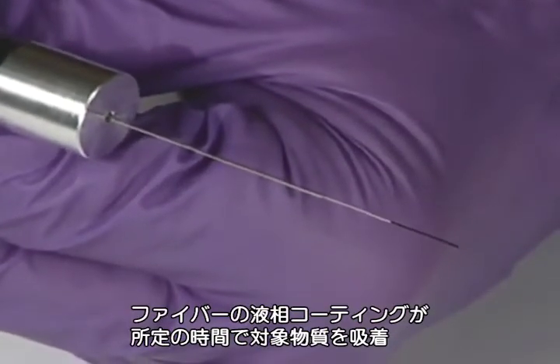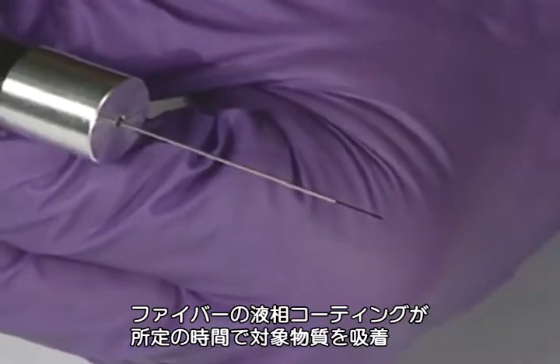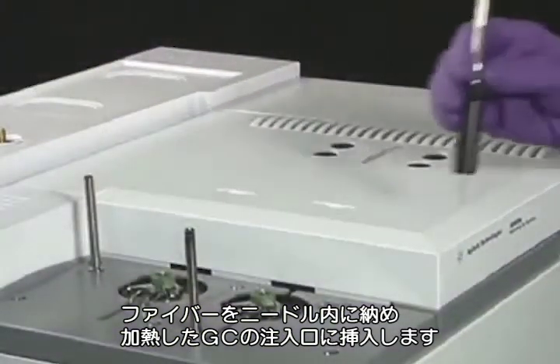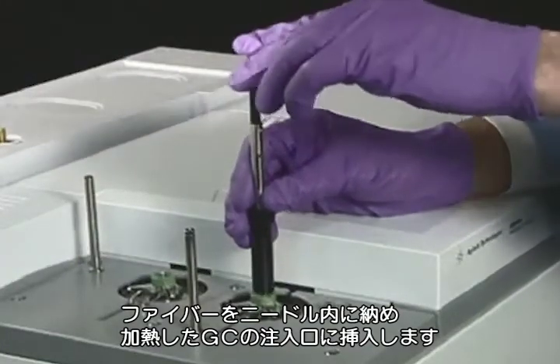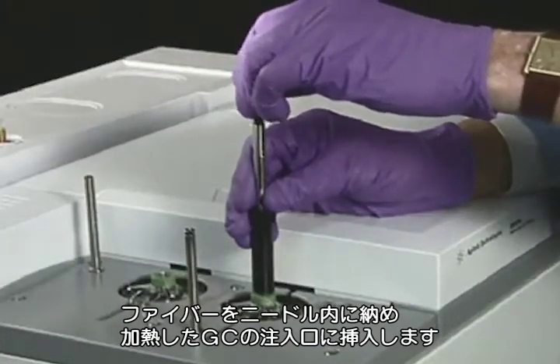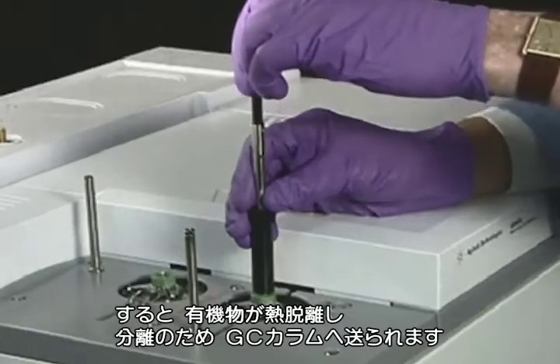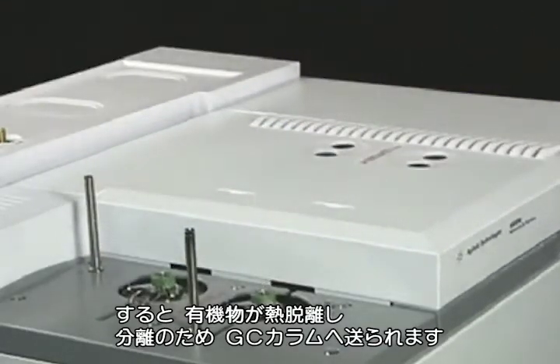The organics are absorbed onto the liquid coating of the fiber for a predetermined amount of time. The SPME fiber is then retracted into the protective needle and injected into the heated injector of the gas chromatograph. The organics are then thermally transferred onto the chromatographic column for separation and measurement.